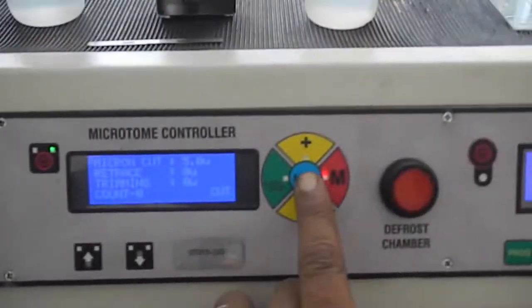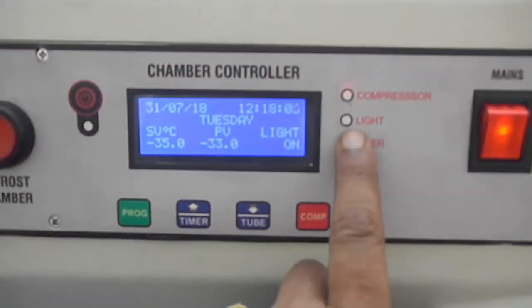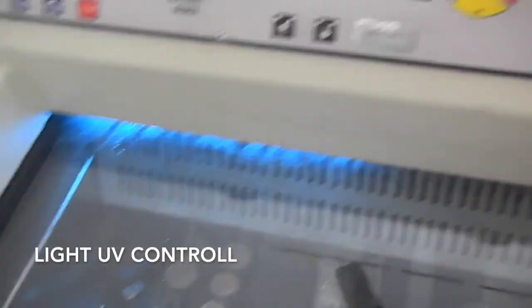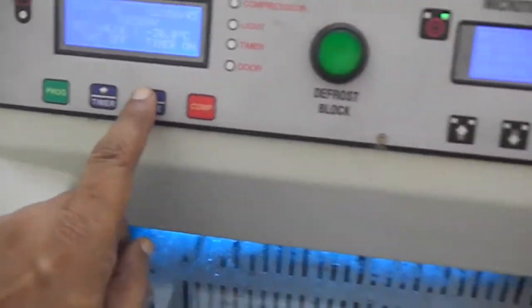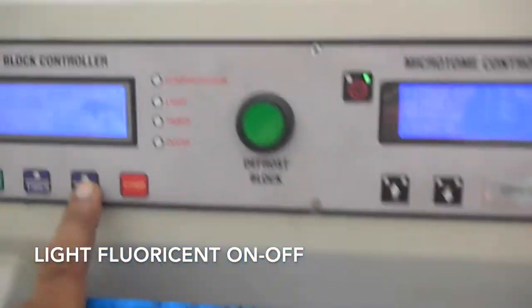Here is the menu. This is the temperature. If I want to switch on the light, there is one UV light here. Now you see it is switched on and off. UV light, you can switch on and see this. Similarly, this controller has a fluorescent light. You can switch on this light by this. You can switch on and off. Inside the chamber you can see.